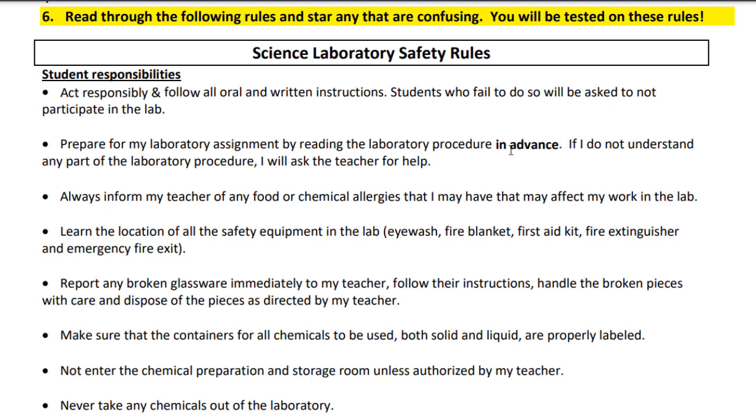So for example, let's say you had to boil something. You had to put a test tube into a beaker and boil it. If you didn't at the very beginning turn on the hot water and get it boiling, you wouldn't be ready by the time you had to put the test tube in. So things like that. You want to read through and then you can, with your lab partners, divide and conquer. Okay? Let me know if you've got any kind of special allergies.